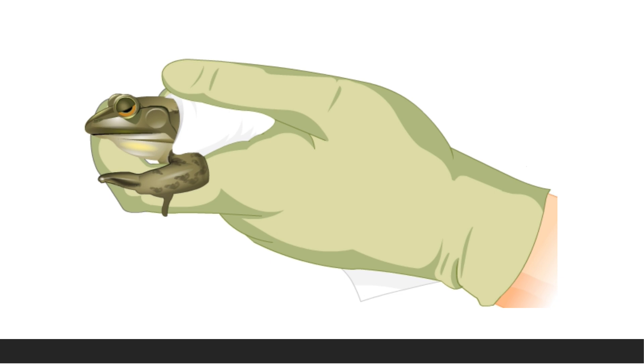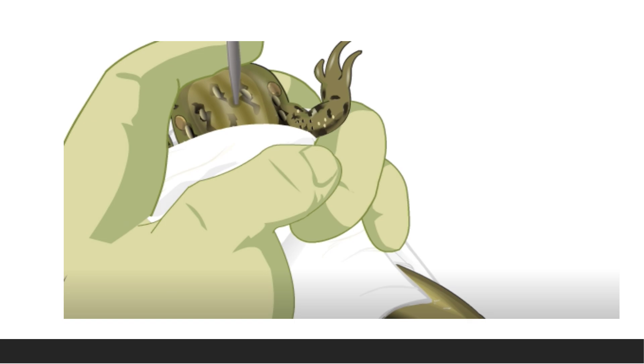To perform pithing: hold the unconscious frog in the left hand using a piece of cloth and ventroflex the head with your index finger of the left hand. In that position you will feel a depression at the mid-dorsal line where it intersects the imaginary line joining the posterior borders of the tympanic membranes. This depression indicates the junction of the skull and the vertebral column.